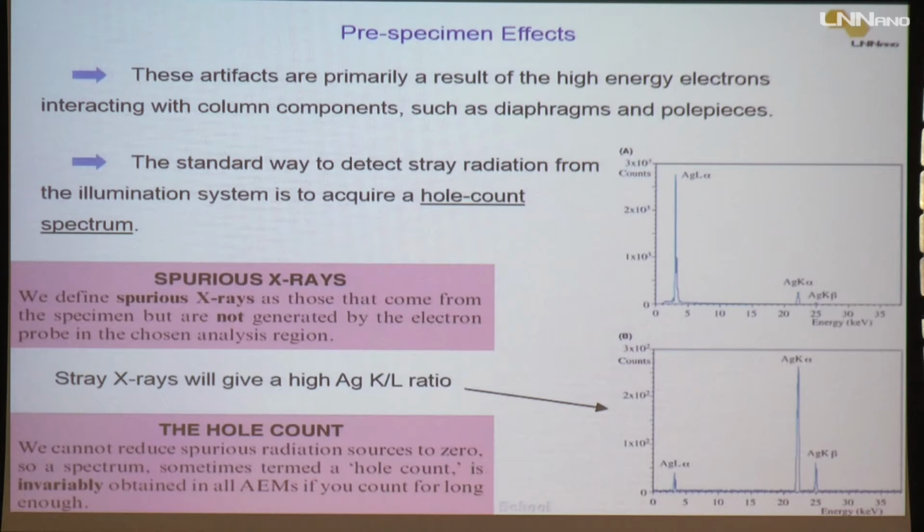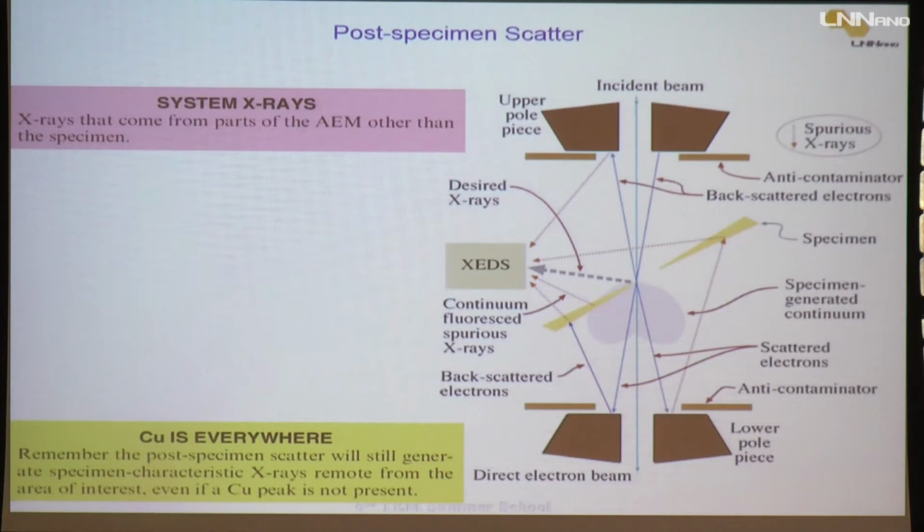This is why it's not real, because all the low energy X-rays will be preferentially absorbed on the way to the detector. The higher energy will lose less intensity, and then the proportion will change. Okay? But this is artifacts.